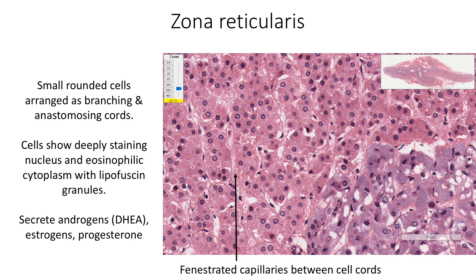Zona reticularis is the innermost zone of the cortex. It is made up of small rounded cells arranged as branching and anastomosing cords, which almost form a network or reticulum — hence the name zona reticularis. These cells show deeply staining round nuclei and eosinophilic cytoplasm containing smooth endoplasmic reticulum, mitochondria with tubular cristae, lysosomes, and lipofuscin granules which increase with age. These cells secrete androgens as well as estrogen and progesterone. Between the cell cords, we find fenestrated capillaries.